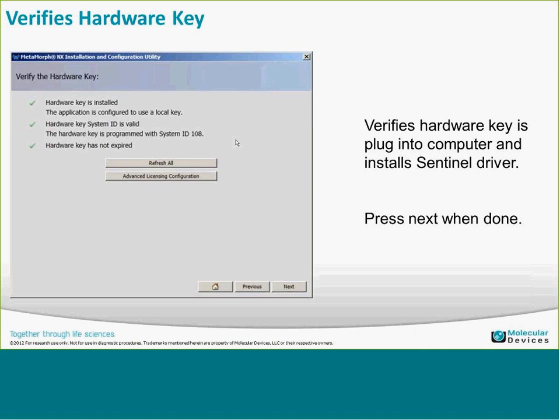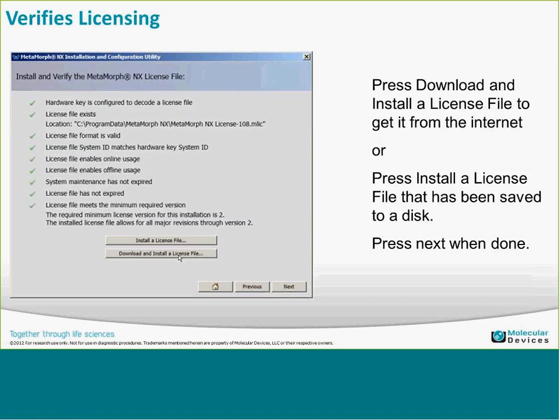Then we have the license file. There are two different ways to do this. The first is to install a license file you have on a thumb drive or hard drive — you navigate to the directory, and it copies the file into the appropriate folder. Additionally, if the system is connected to the internet, you can download and install a license file. Once downloaded, you'll get all the checkboxes and it tells you where the file is located.